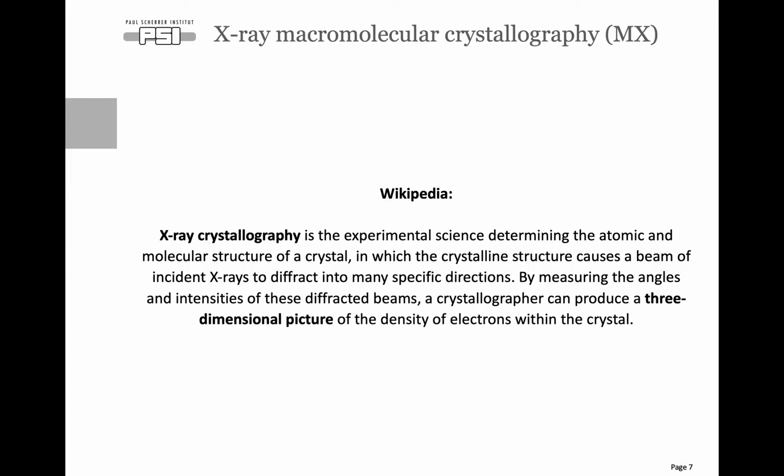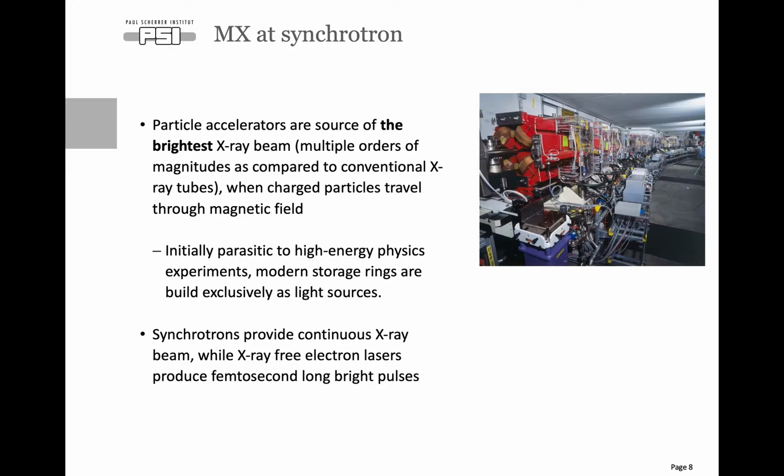So X-ray crystallography is an experimental technique to find atomic and molecular structure of a crystal via diffracting of an X-ray beam into many directions. What is important is that macromolecular crystallography can be very efficiently done at particular accelerators called synchrotrons.